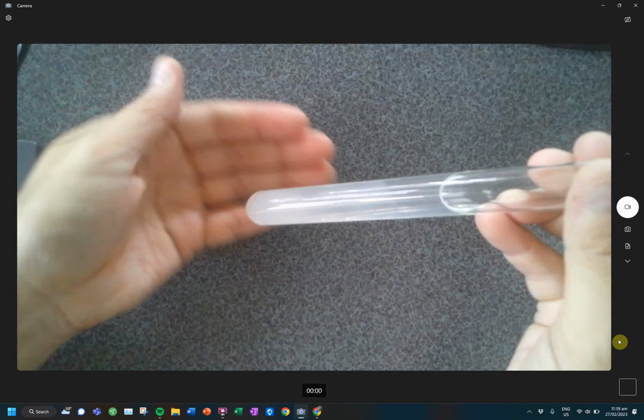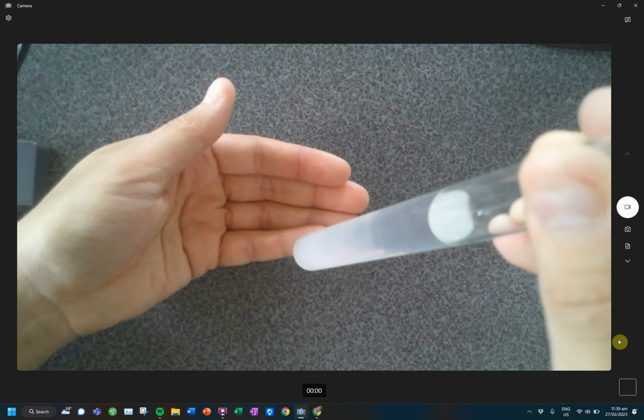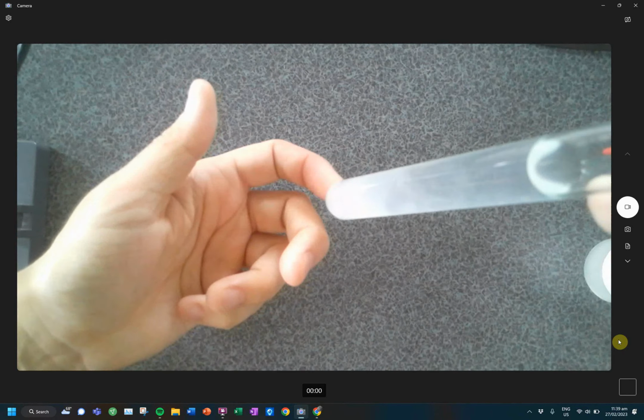But we can see at the top that it's starting to disappear, right? So in this case, if I'm not 100% sure, what I can do is take some of this out and add it to another test tube. So I'm going to grab myself a little pipette, because sometimes it's all about getting the ratios right.